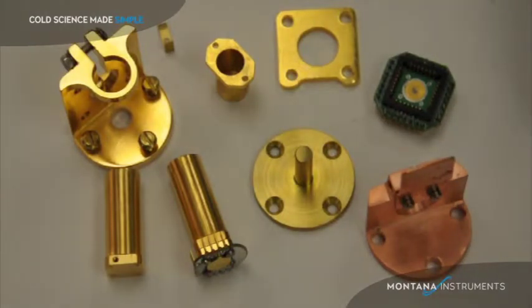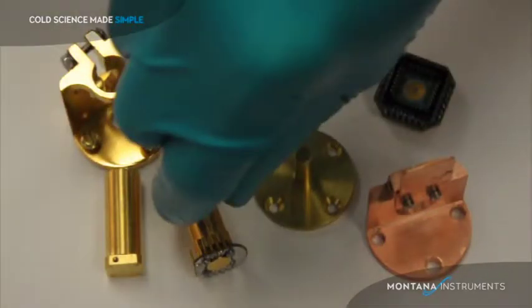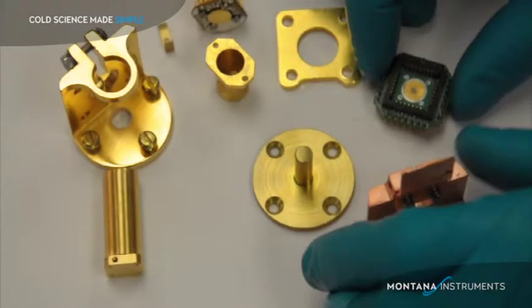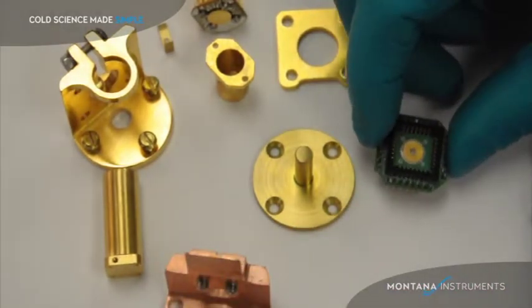Whatever plate you use, be sure you grip it firmly to the cold plate. A strong bolted connection is much more important than large surface area.